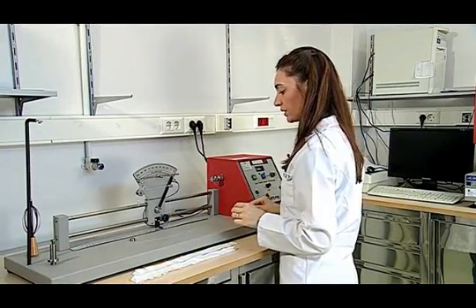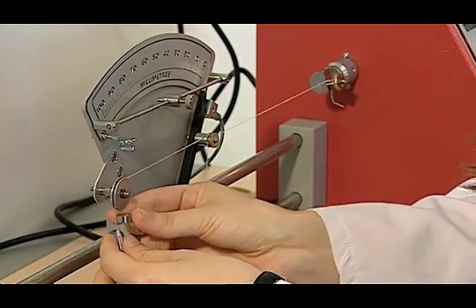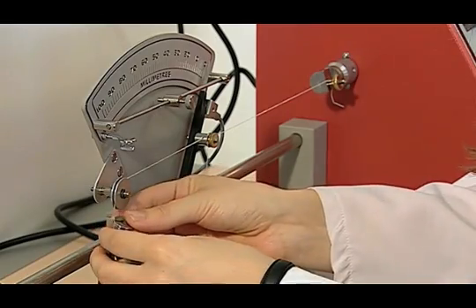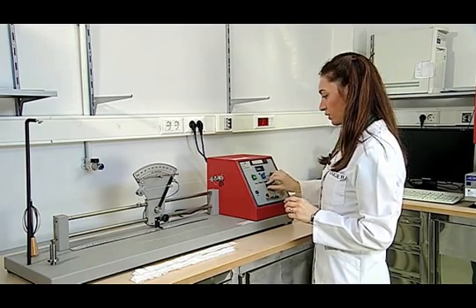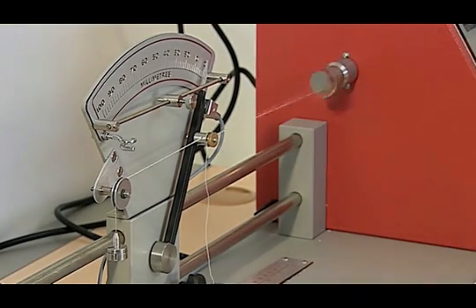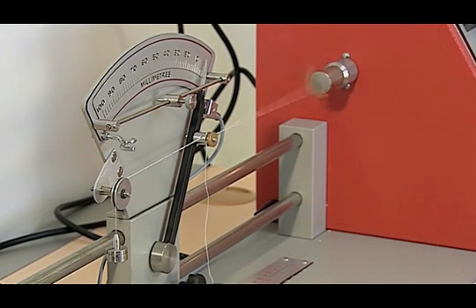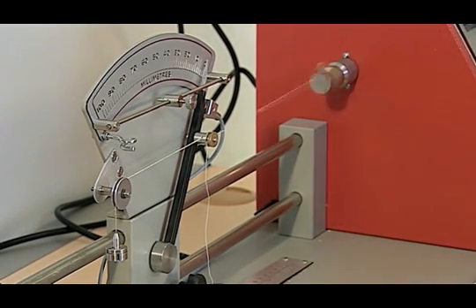We put the proper tensioner weights chosen from the table according to the yarn number. Then we start to test for the twist opening of the yarn. As the twist is opening and the yarn is growing longer, the pointer is also moving. The twist of the yarn will be fully opened at a certain position and the pointer will become fixed there. Then it will start closing, and the pointer will move in a reverse direction. Finally, it will reach the zero point, at which the test is finished and we are able to read the twist value on the screen.